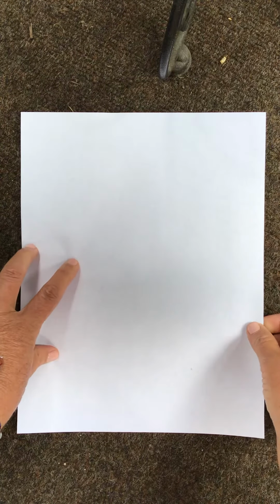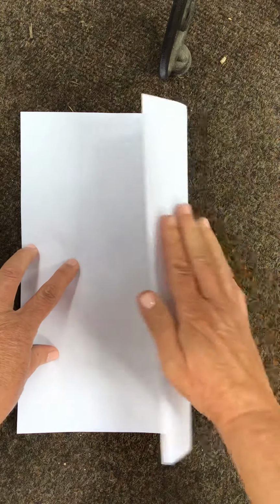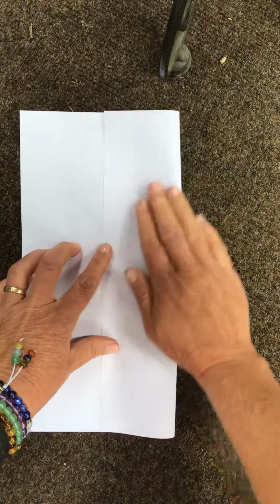Okay, so here's how to make a druggist fold. You've got just a regular old piece of paper, 8.5 by 11. And the first thing you want to do is seal it on both sides. So we're gonna try to fold this in thirds.